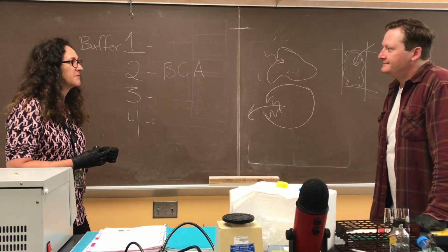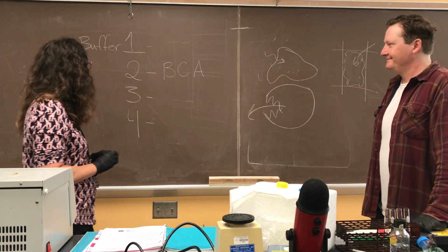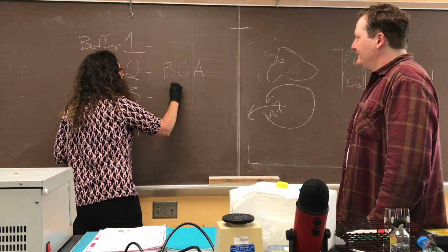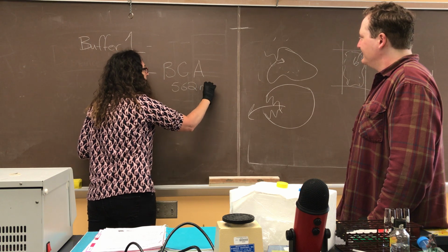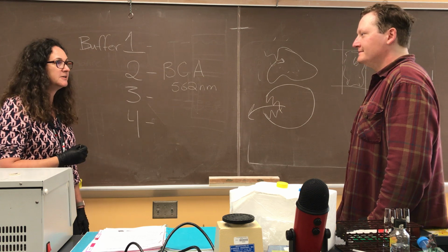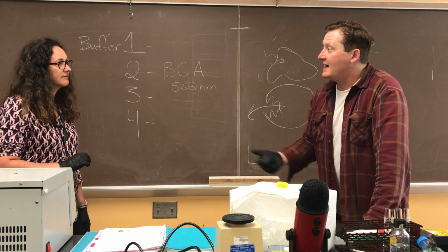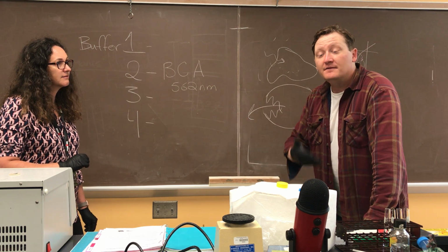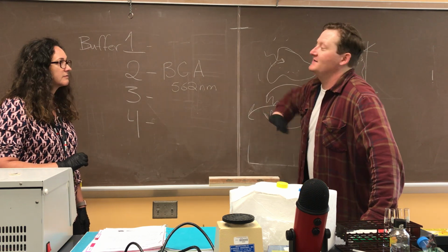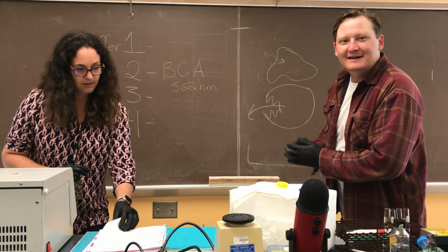We'll use the SpectraMax spectrophotometer again to do those readings. Right, and the purple color, the absorbance that we're going to measure is at 562 nanometers, the wavelength of the purple light that will get absorbed. Yeah, so this is only slightly different from the photosynthesis lab, which will occur in Bio 105. In that lab, we're measuring absorbance of the molecules directly. In this lab, there's a reaction that yields something else that we then measure. But it still represents the amount of protein in the sample.